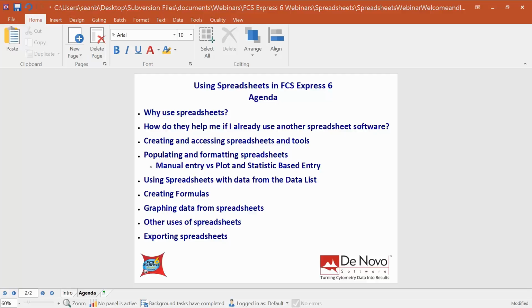If you were using Excel or Prism, whether you were using FCS Express or some other software to analyze your flow data, you'd probably have to export that data to Excel, and then if you ever needed to come back and make a change, you'd have to go back to FCS Express, make a change to the gate, go back out to Excel, and move iteratively in that fashion.